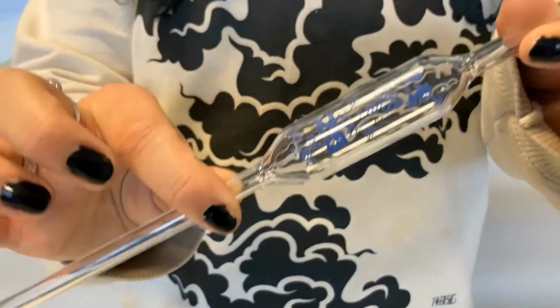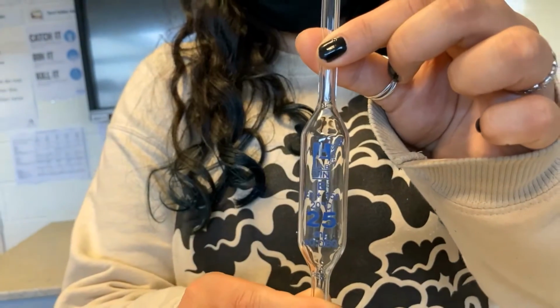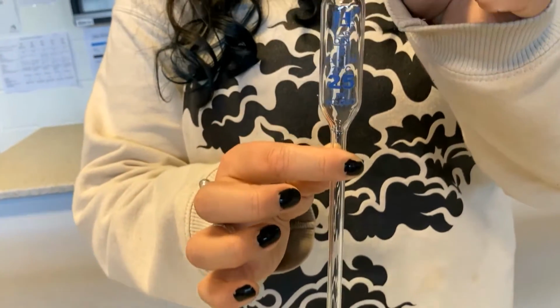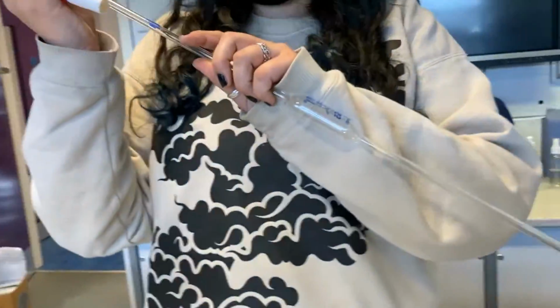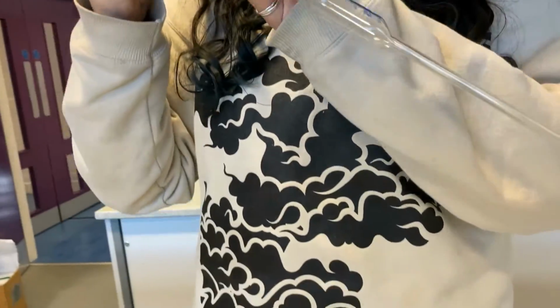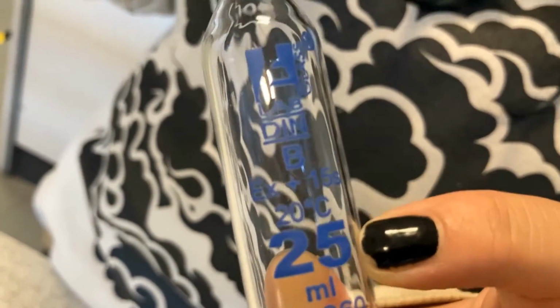So what we're going to do is use this thing, which is a very, very fancy and expensive pipette, okay? This is super accurate compared to the slightly rubbish ones that we use normally in science lessons that are made of plastic. And this little contraption is going to help us suck up the liquid that we need. So if you zoom in here, it says 25 millilitres, okay?